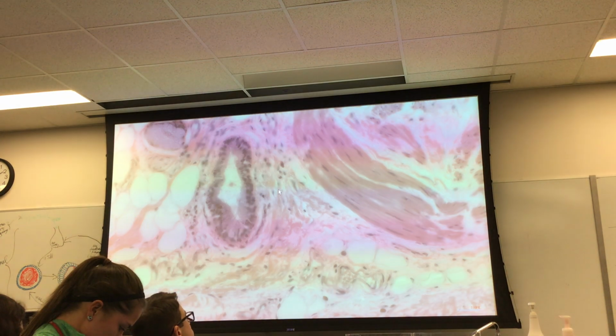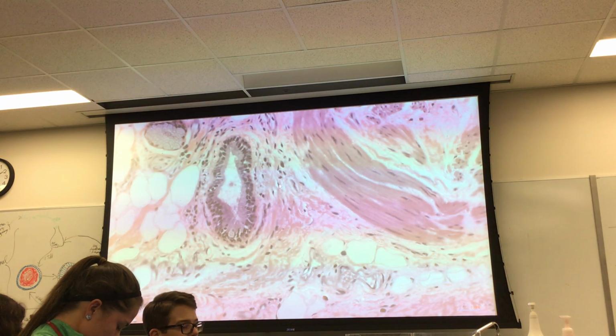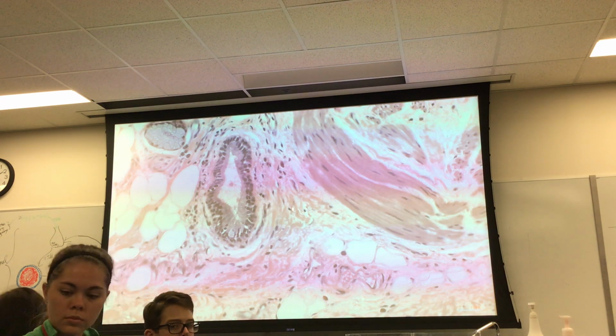Give me a second. Right here. Okay. So, are these guys elastic fibers right here?